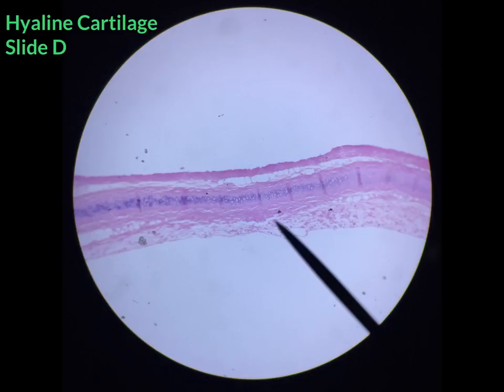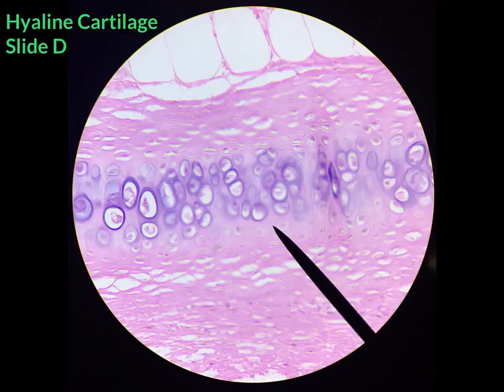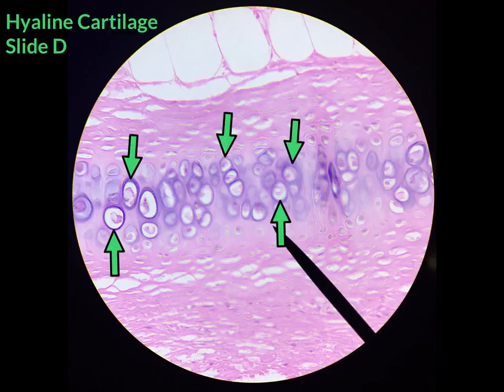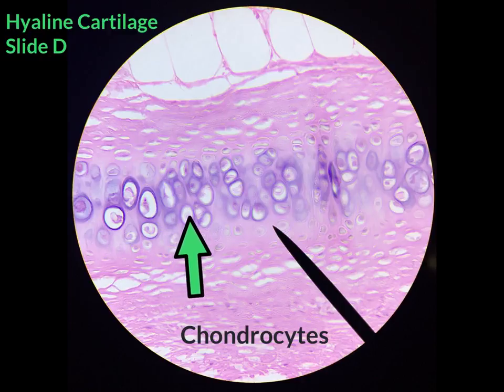Under low power, what you see here is hyaline cartilage. You can find hyaline cartilage on slide D. Taking a closer look under low power, you can see that hyaline cartilage is made up of cartilage cells called chondrocytes, which are shown in purple here.